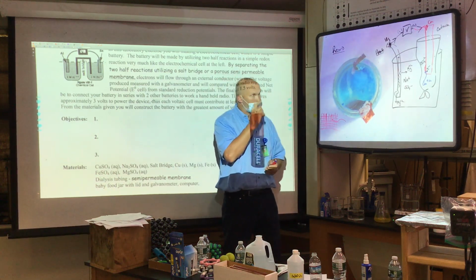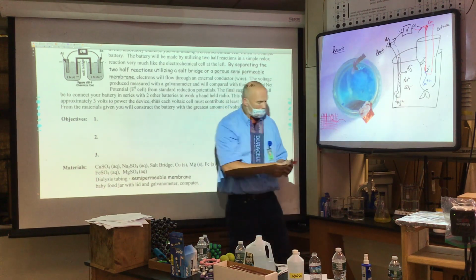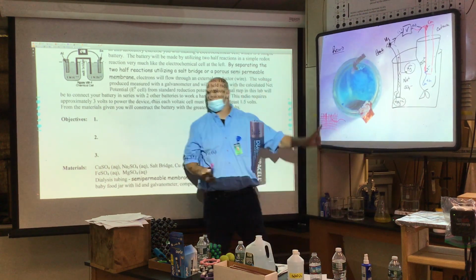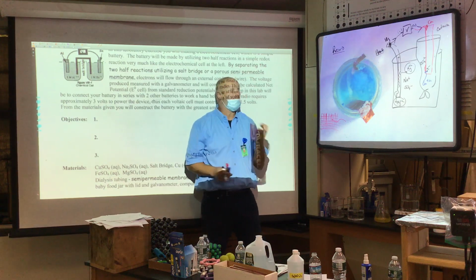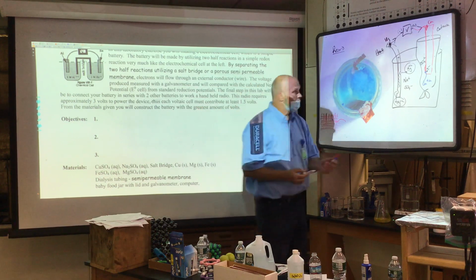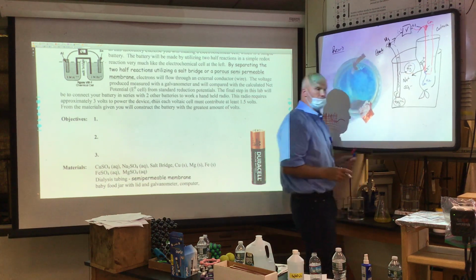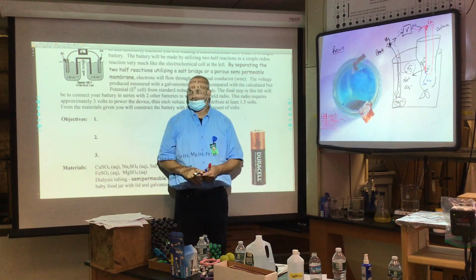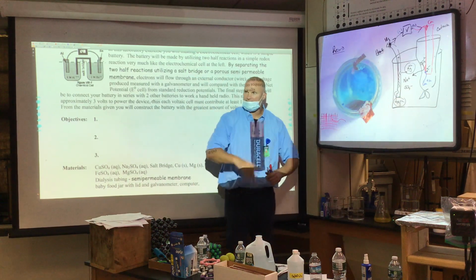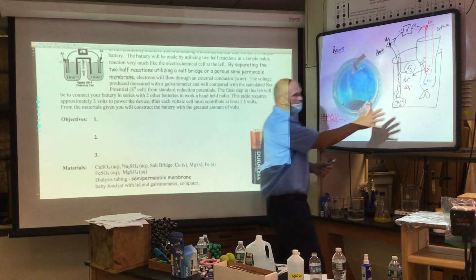It's a semi-permeable membrane. So, in this oxidation half cell that we identified, we know that the Mg2+ is increasing. Well, electrons will never leave something positive, so we need a negative ion to flow. And what flowed is this sulfate -2 ion, which left the inner bag and had to move out. If this was a solid plastic bag with no pores, you get 0 volts because you needed that negative ion to flow toward the oxidation half cell.